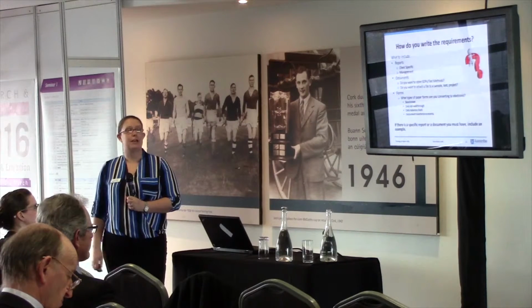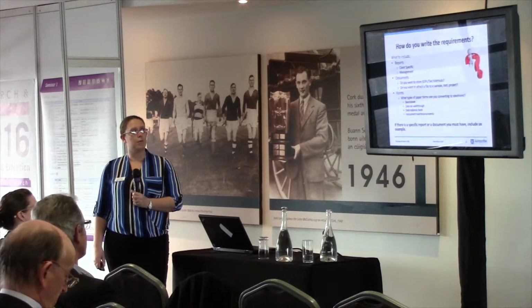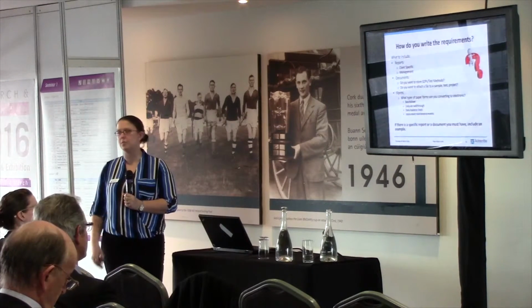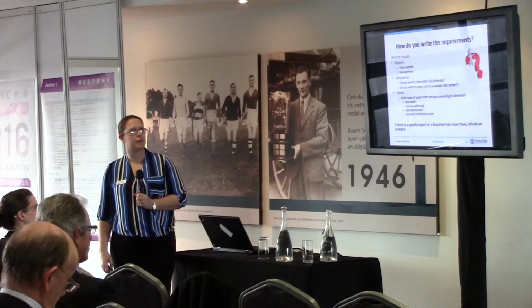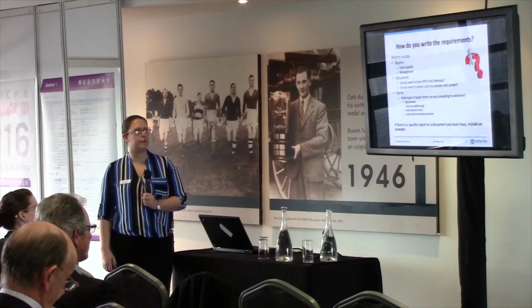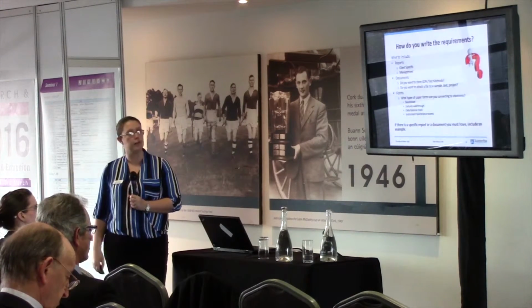Come back to the reports again. Are they client specific? Are they just management reports? What SOPs do you need in there? Do you need to attach files to samples? Different forms. What sort of bench sheets do you need? Daily lab walkthroughs? This kind of thing. What does the system need to output for you to do your job?